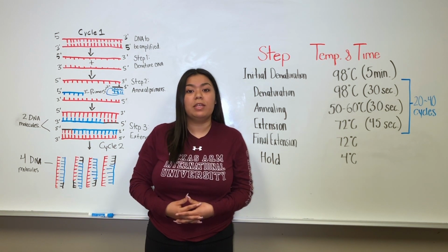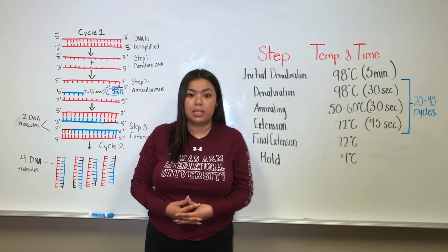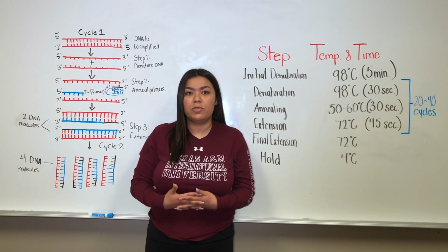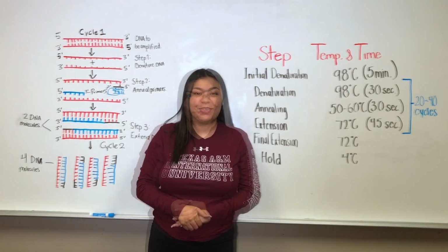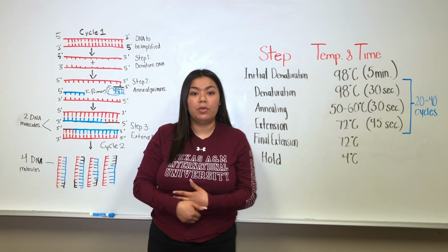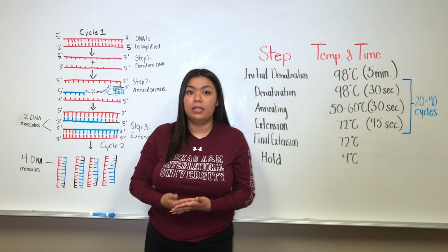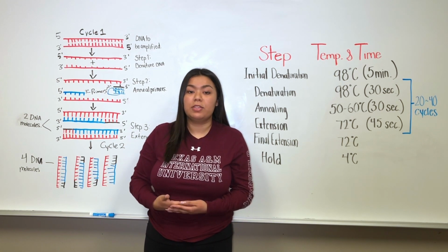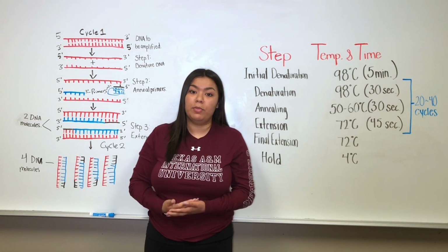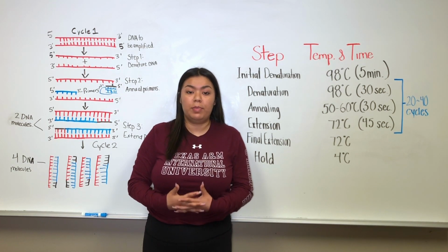A thermostable polymerase enzyme drives PCR. This polymerase will synthesize a complementary sequence of bases to any single strand of DNA, providing it with a double-stranded DNA. This is useful because you can choose which gene you want to polymerize. In a mixed DNA sample, you can add small tiny pieces of DNA to find a complementary DNA to a gene. These small pieces are known as primers because they prime the DNA and make a sample ready for the polymerase to bind.